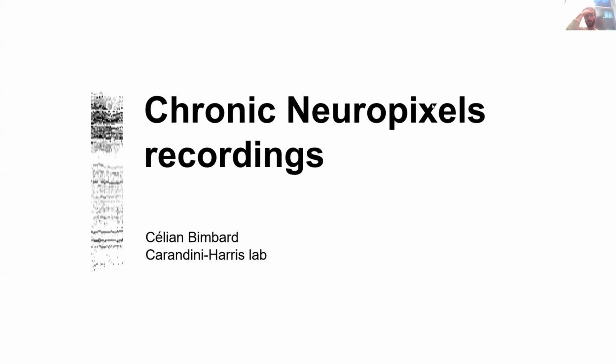Great. Yes, I'm going to talk about chronic Neuropixels recordings. As Julia just said, there are two ways of going, acute and chronic. But maybe before I start, I just wanted to say that most of the things that Julia said are going to be exactly the same with chronic, and mainly about the quality of the craniotomy you need to have, sharpening the probes and so on.